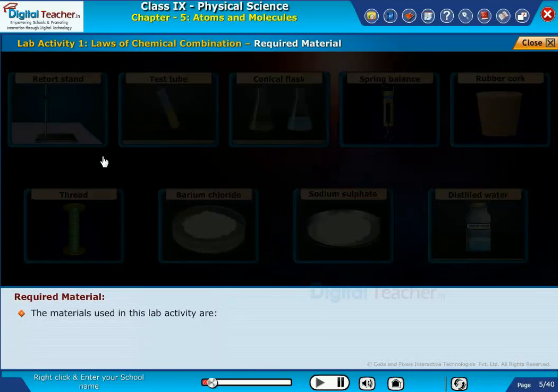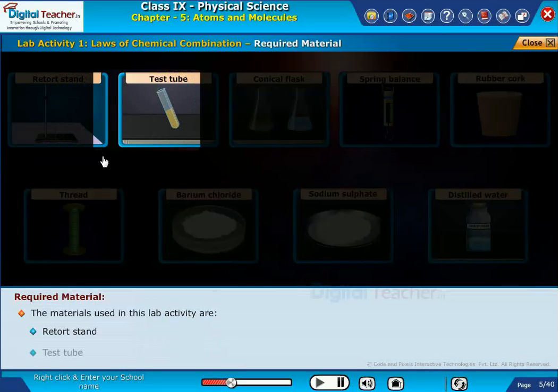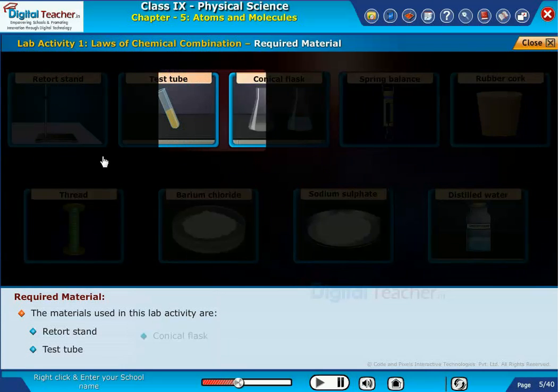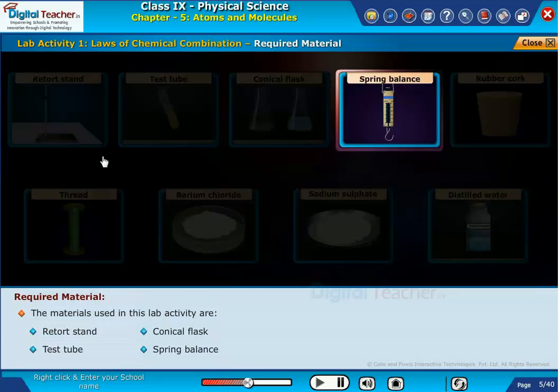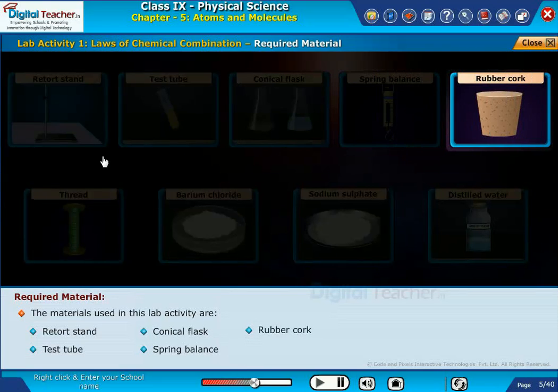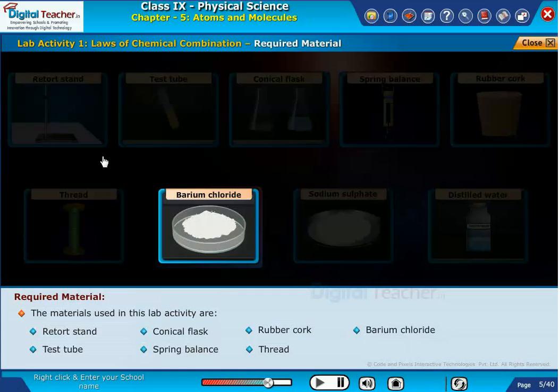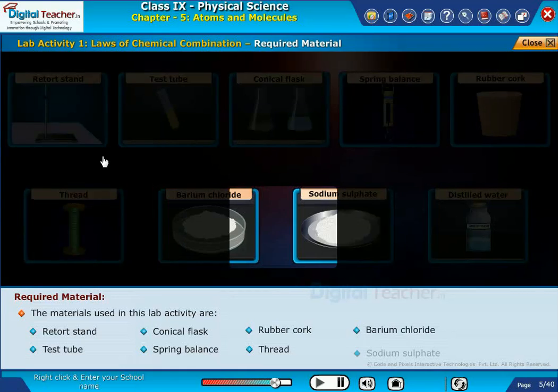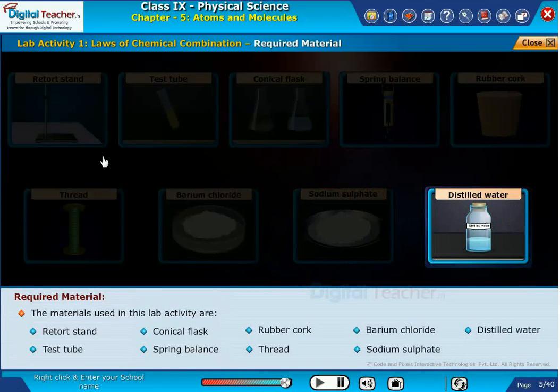The materials used in this lab activity are: retort stand, test tube, conical flask, spring balance, rubber cork, thread, barium chloride, sodium sulfate, and distilled water.